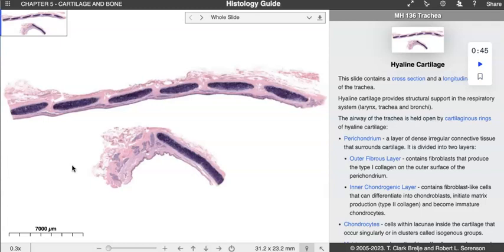The video of me is going to get eliminated because I need more of the screen at this point. So let's go ahead and take a look at what is more typical to what you guys are seeing in the lab section, which is this bottom view here.